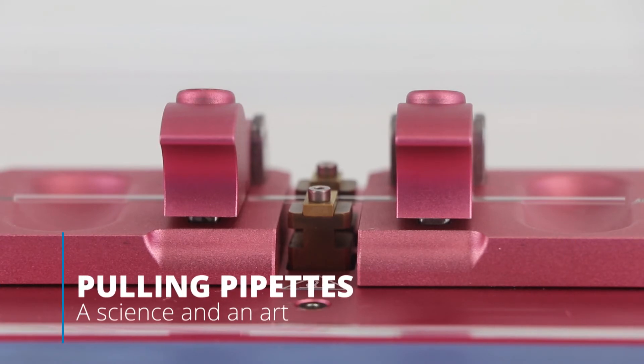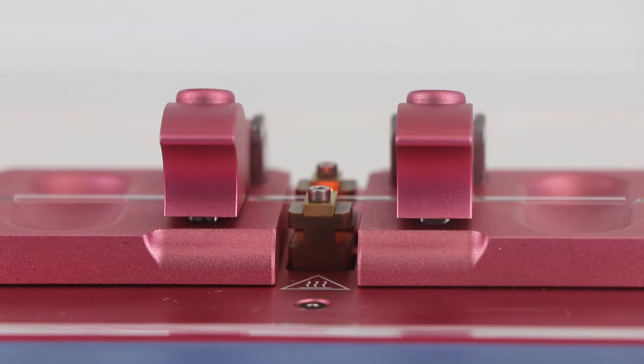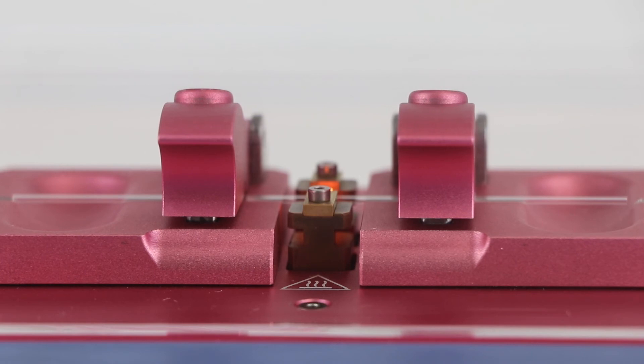Pulling pipettes is a science and an art. Reliable results depend on factors like the operating environment, the type of glass used, and your technique.